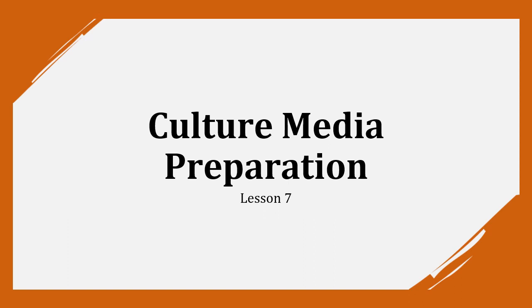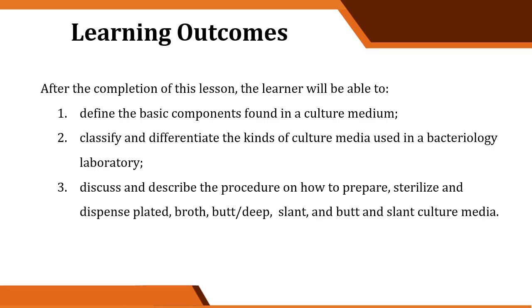Good day. So for this week's lesson, we will be tackling culture media preparation. After the completion of this lesson, you should be able to define the basic components found in a culture medium, classify and differentiate the kinds of culture media used in a laboratory, and discuss and describe the procedure on how to prepare, sterilize, and dispense plated, broth, butt or deep, slant, and butt slant culture media.